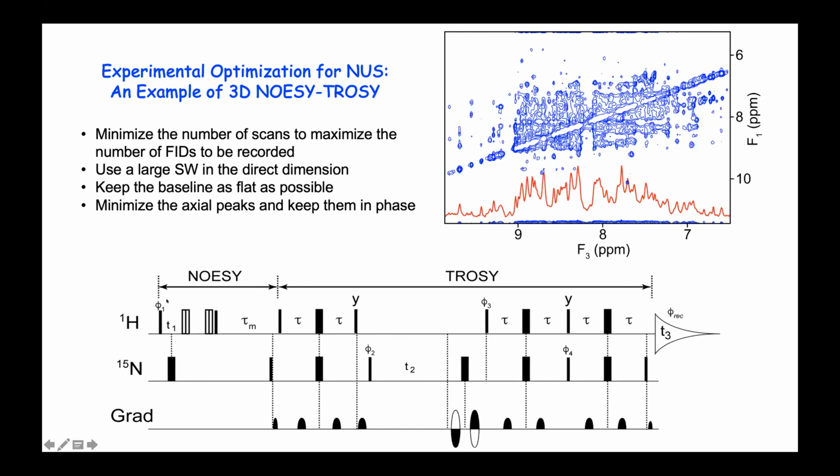The problem is that if you phase cycle a proton pulse without phase cycling any nitrogen pulse, there is no heteronuclei filter. Therefore, water suppression is a little harder to do, right? And water can cause baseline issues and all kinds of issues. And therefore, this is not recommended.